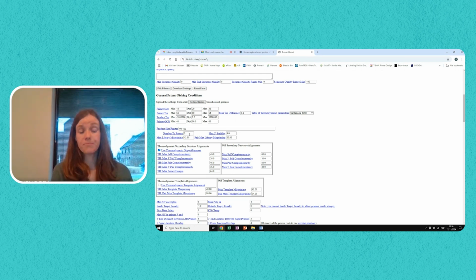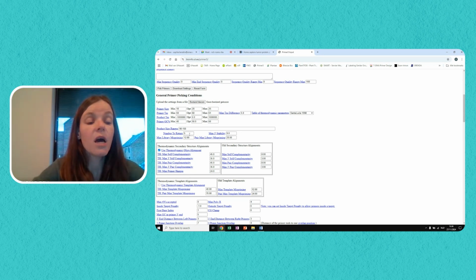So this means when you fill in 5, even though there might be 100 good primer pairs, it will only show you the best 5 possibilities, or it will only show you 5 possibilities. However, it's possible that within these 5 possibilities, none of them bind around an exon-exon boundary. And then you would have to perform your search again.